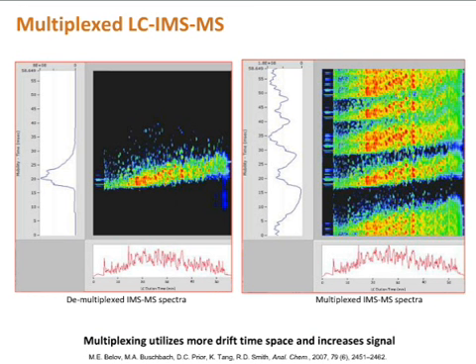We found that this multiplexing approach is very important for increasing signal in LC measurements. And the reason is if you have something really low concentration, you only have a short window of time to get it within the LC. And so if you can cover it 8 times instead of just 1 time, you get 8 times as much sensitivity for that single ion.